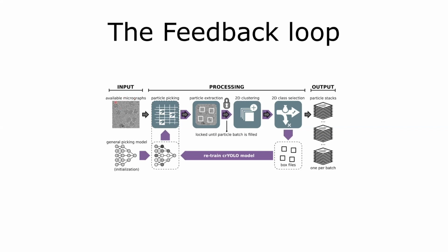So how does it work? First we get available micrographs. Those are produced live at the microscope and are fed into the pipeline itself. Then crYOLO, in this case, picks those particles and provides the coordinates to the particle extraction command. This command extracts the particles and waits for a certain amount of particles to be accumulated.